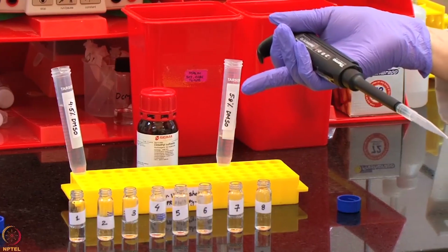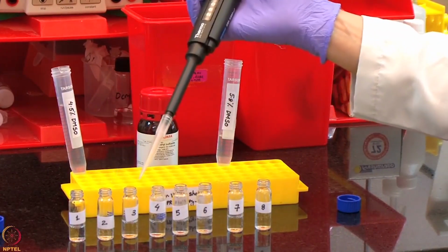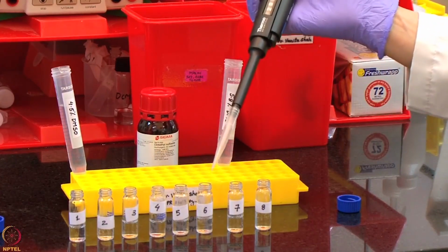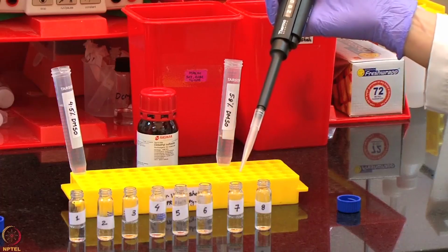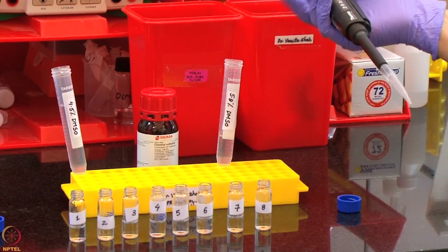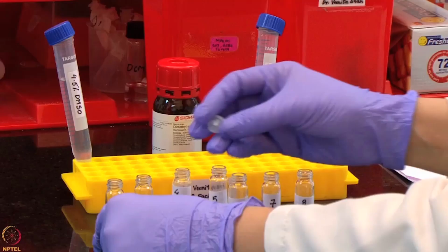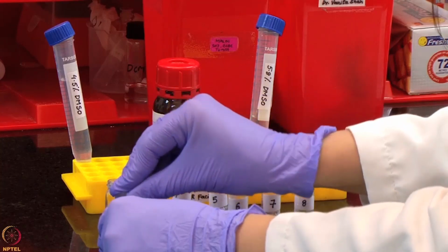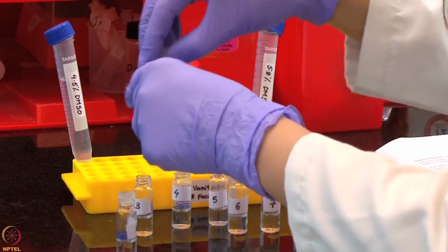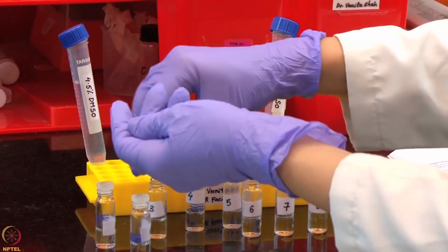Following this, we added 1400, 1200, 1000, 800, 600, 400 and 200 microliters of 5.8% DMSO in tubes 1 to 7 respectively. We will mix these solutions vigorously, put the lids on and keep them in the dark till we are ready with all the other samples.